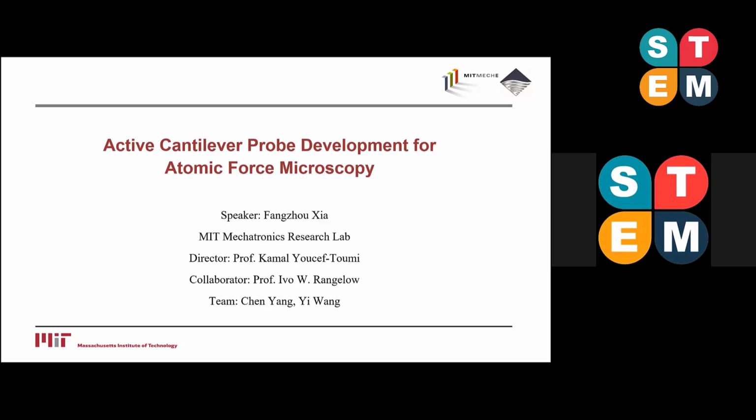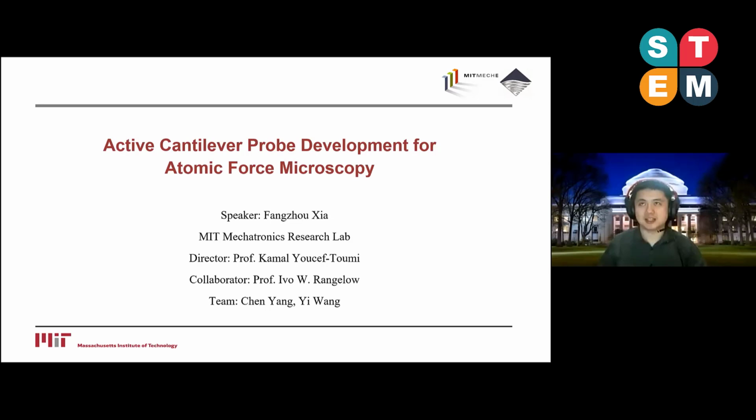My name is Fangzhou. I'm currently a postdoc at the Massachusetts Institute of Technology, working in the mechatronics research lab. So today I'll be talking about AFM active cantilever probes development for new capabilities.